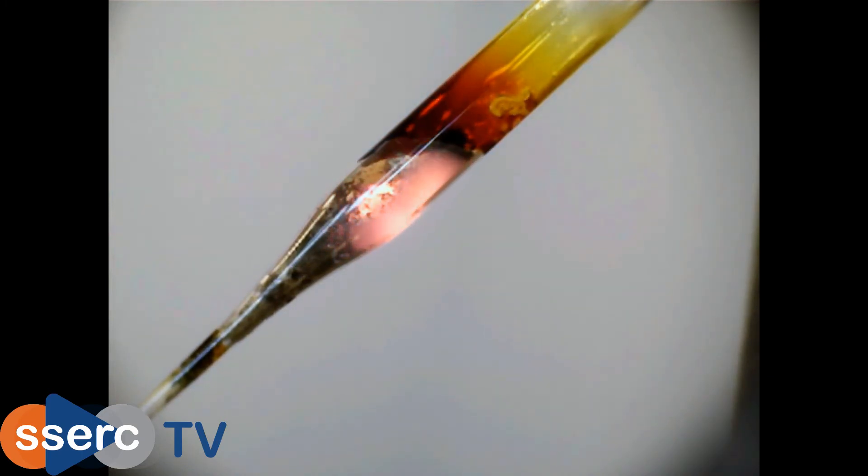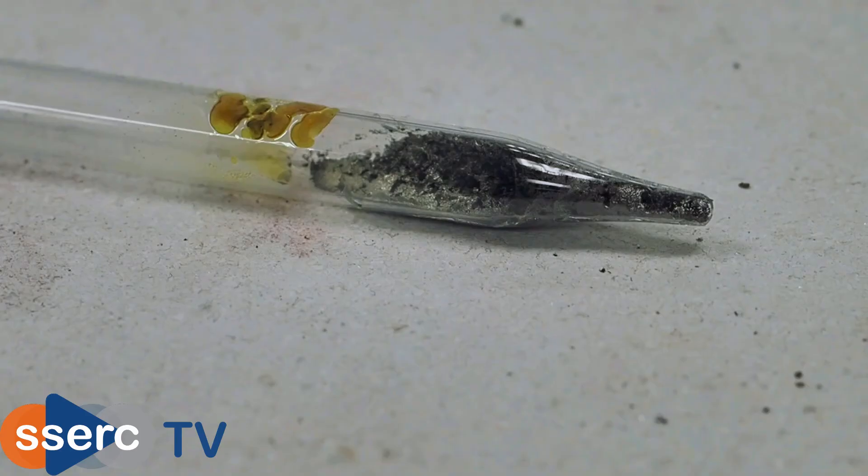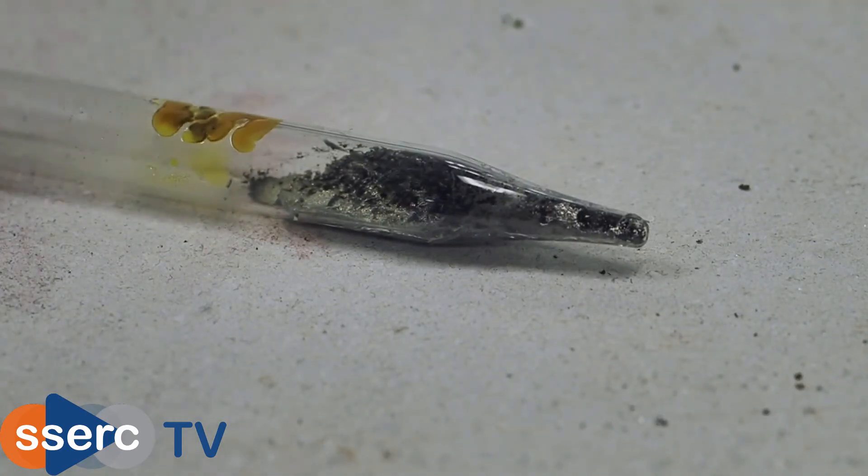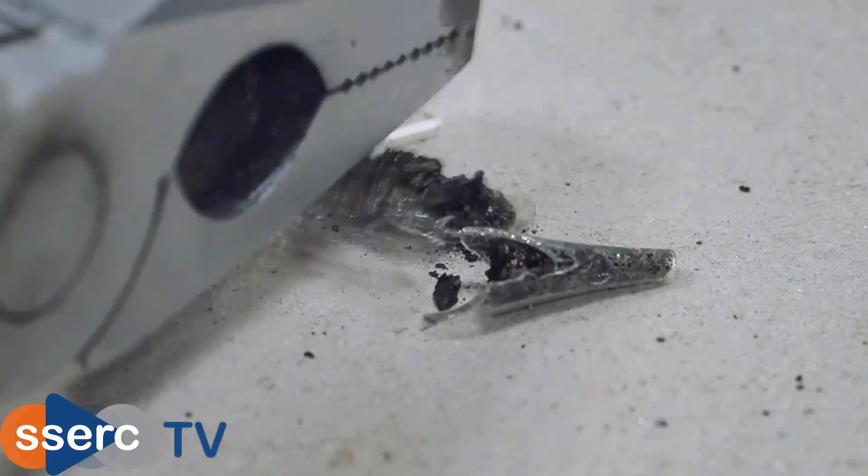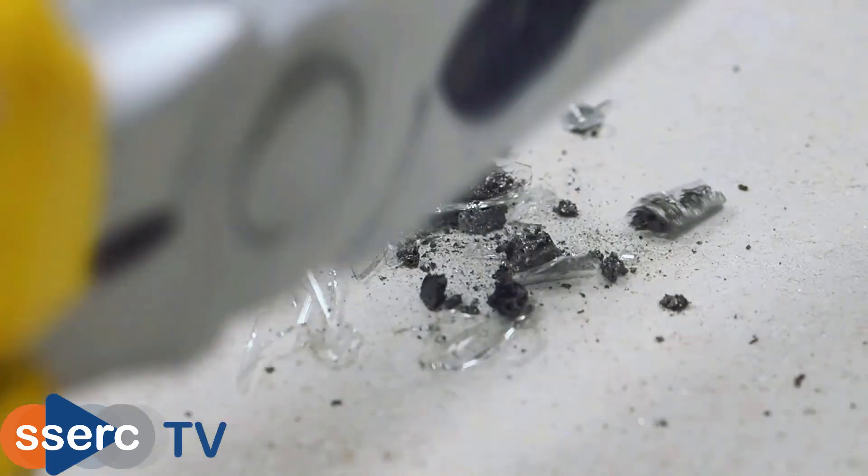Once the reaction is over let the tube cool and then extract the residue. We'll need to break the pipette for this. You can see that we have a shiny grey metallic looking substance. This is iron sulfide.